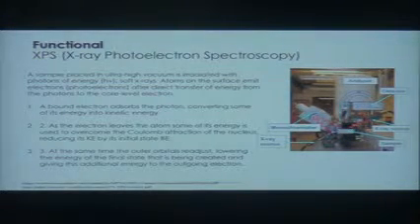All right, so what happens here is you shoot an X-ray at a surface and you excite the electron enough so that it comes out of the material, and because you know something about the electronic states of different bonding arrangements, because when I say a chemical bond in a material, what we're really talking about are the electrons in the bond. And so you have sort of a catalog of bonds of different materials, and usually you know at least what the elements are or what they might be in your material. You have this catalog of bonds, and what you're really doing in XPS is measuring the bond energy.